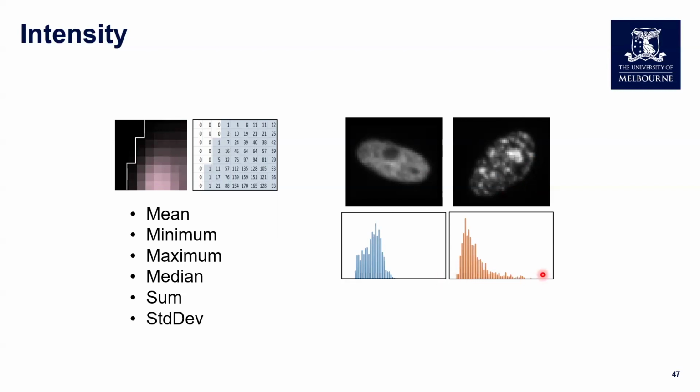And we can measure such dispersion. The standardized measure of it is called the coefficient of variation, which is the ratio of the standard deviation to the mean. This value can be the measurement for the degree of fragmentation or homogeneity of intensity.